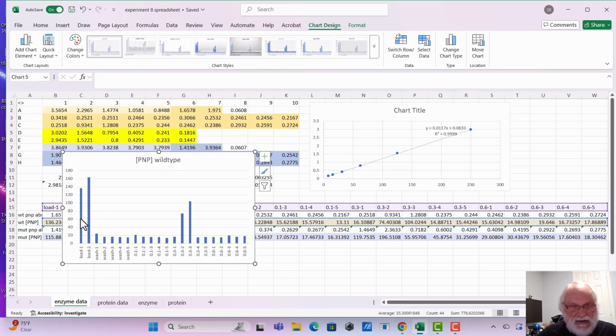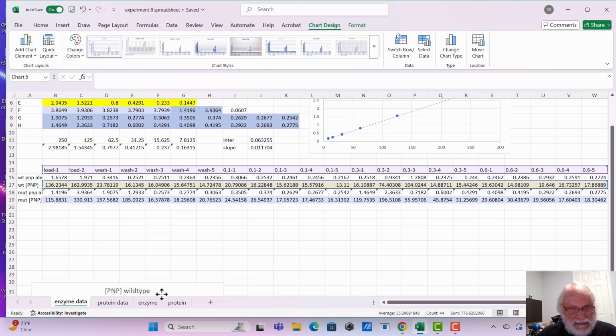And we see here, there's a couple of values. These kind of washed off from the load. And here is the product we load. And that's about where I kind of expect it to be. Let's go ahead and put that down here.